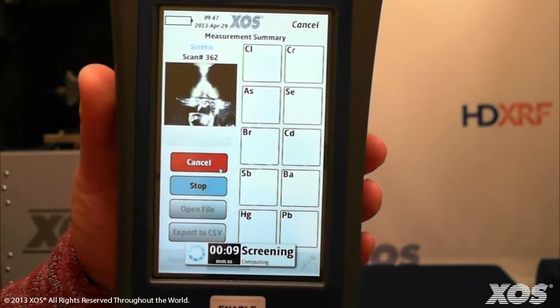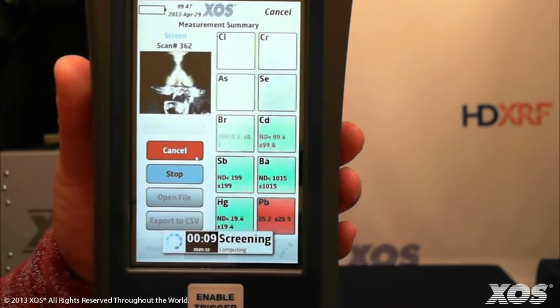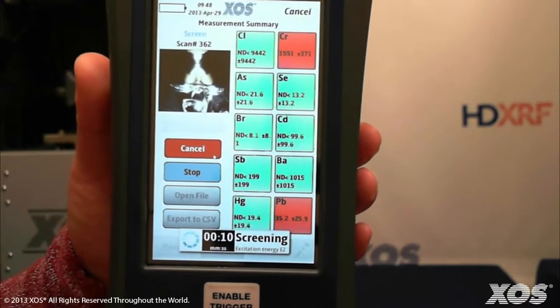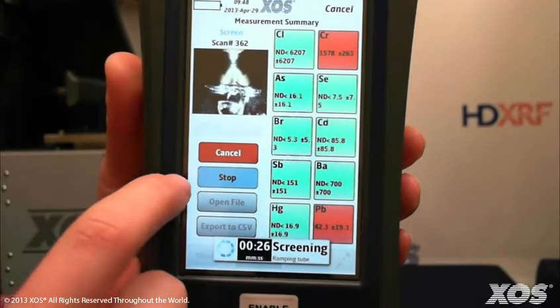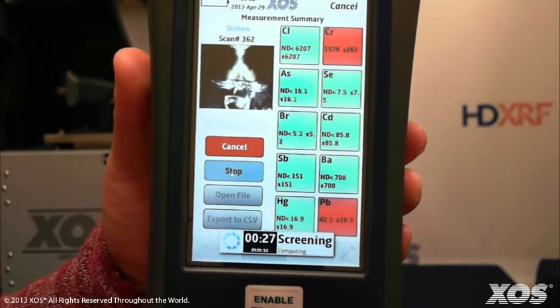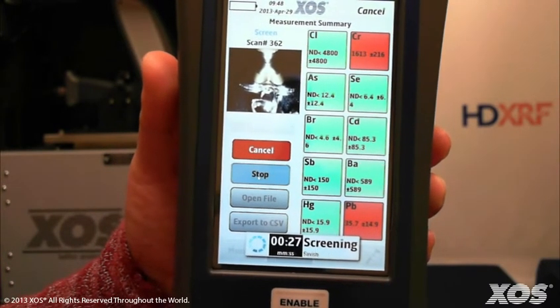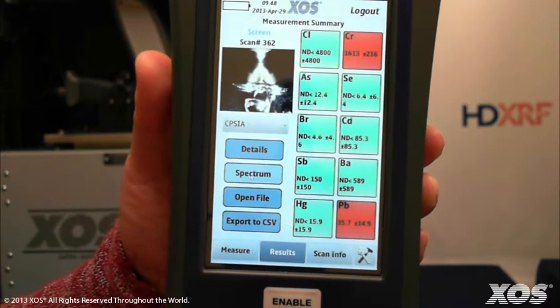The easy-to-read, pass/fail, color-coded boxes that display will turn red if any amount of that particular heavy metal is detected. In this case, since screening revealed the presence of lead and chromium, our next step is to go ahead and quantify the sample in order to obtain certifiable values for those elements.